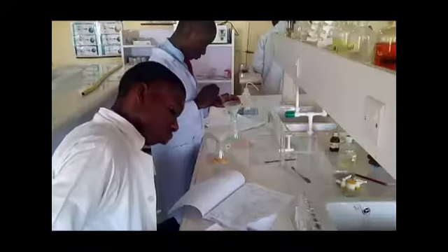Now our table of values for inference test is different from that of titration and is shown here in the book. We have the serial number, the test, the observation, and the inference. Now our class practical will be carried out in a few hours. So then we'll show you how the values are entered into the table.